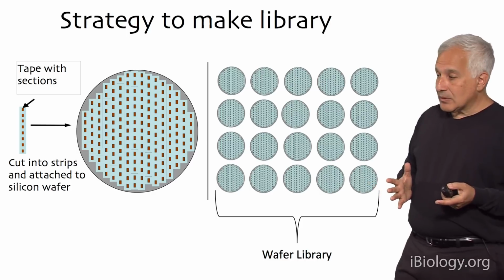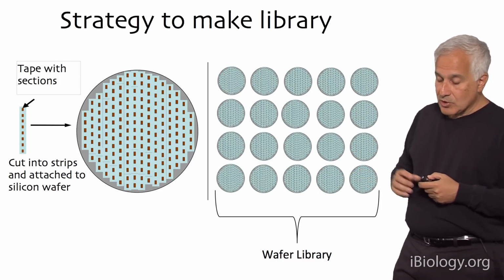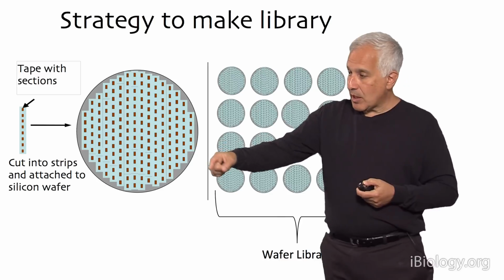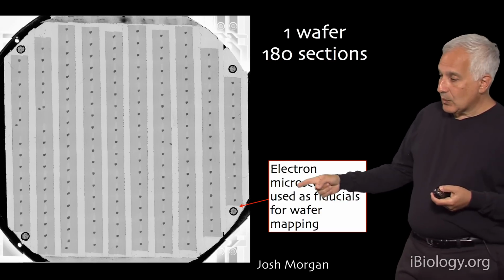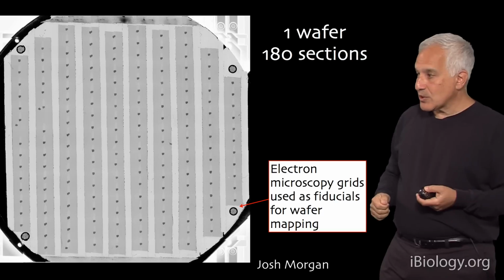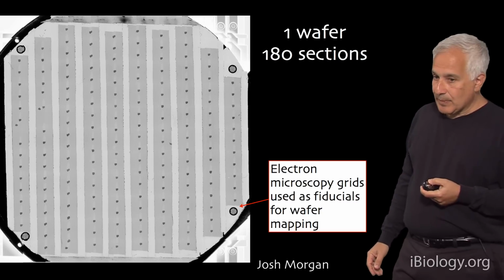And now we have a data set of 55 such wafers. They're about the size of CDs, which is a substantial chunk in thalamus, for example. If we look at one of these wafers in the electron microscope, that's what it looks like. Each of the sections, you can see one after another. We use little grids, the old-fashioned grids that were used to pick up sections before, now as fiduciary marks to allow us to align the wafer in the electron microscope.